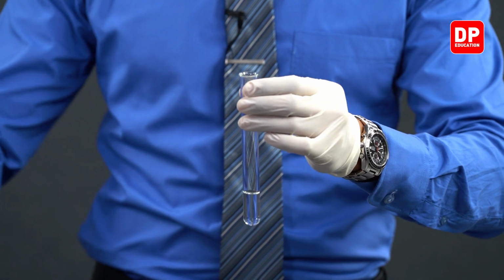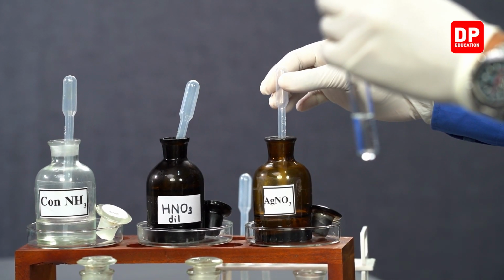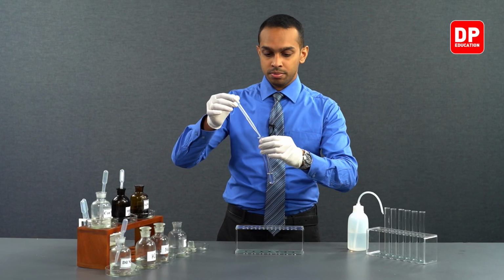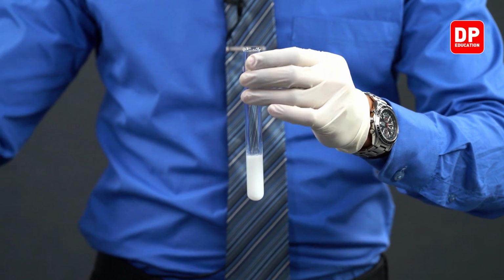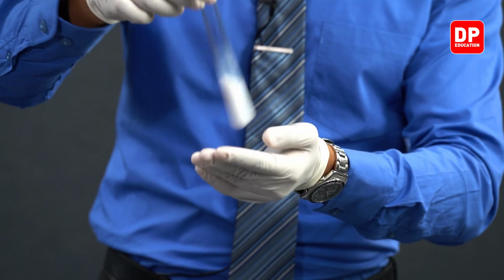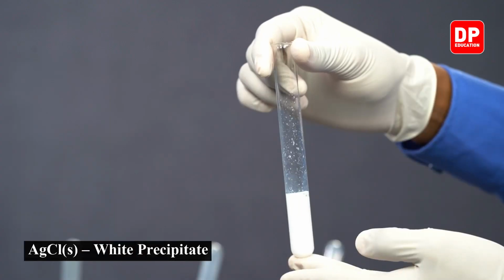And to it, we'll add a little bit of silver nitrate. As we mentioned before, we'll be forming a white color precipitate, which is silver chloride.